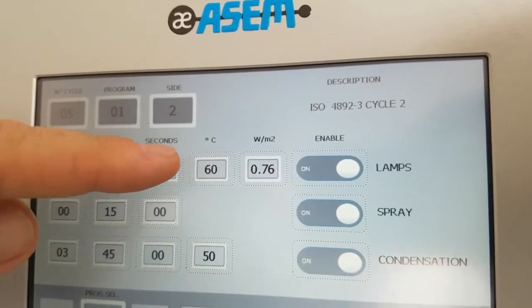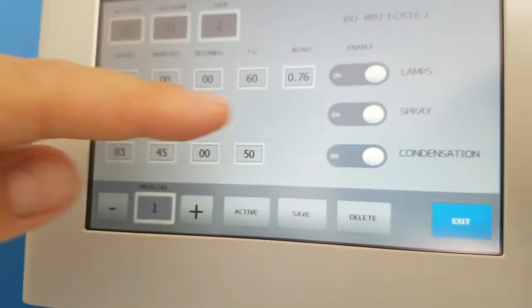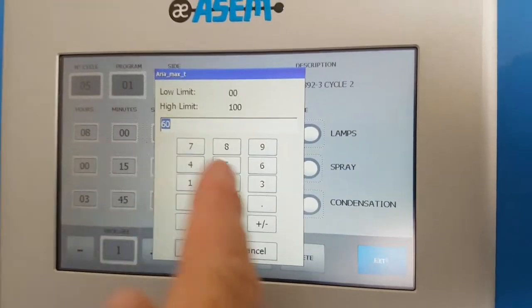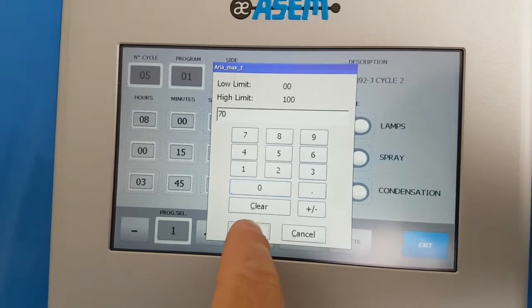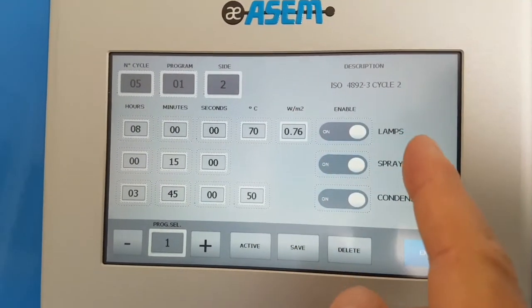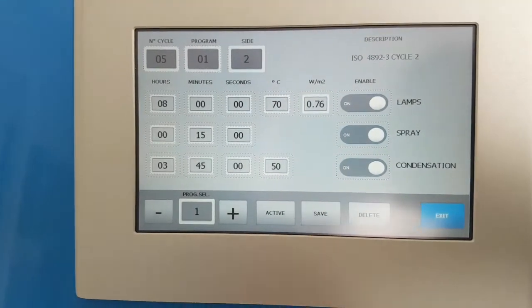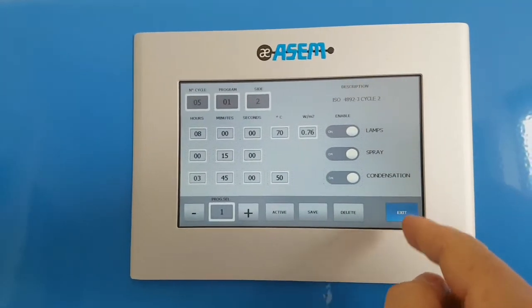You can see the temperature: 60 degrees for the lamps phase and 50 degrees for the condensation phase. If you want to modify a value, just click on the value, modify it, and press enter. If you want to save this cycle you have to press the save button; otherwise, if you exit, the program remains the same as before.